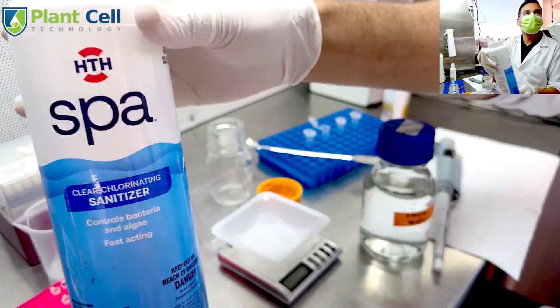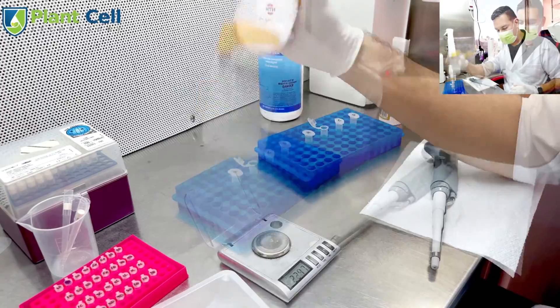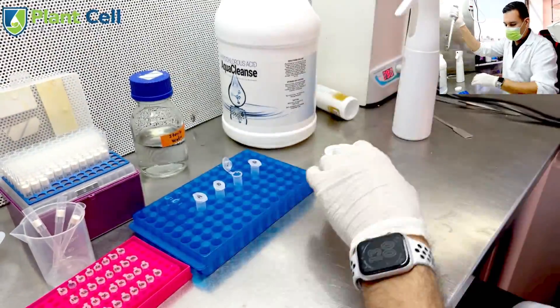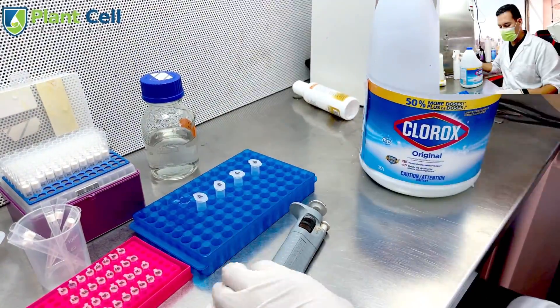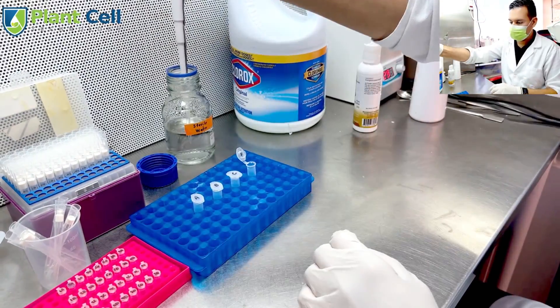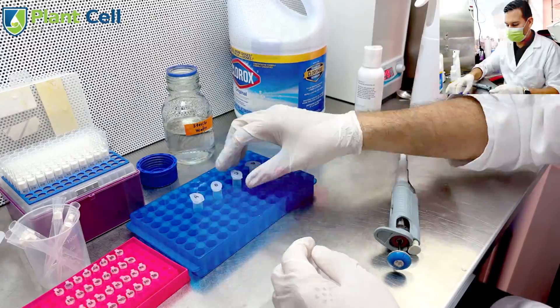My second sterilizing agent is sodium dichloro. To make it, I take 100 milliliters of water, measure 0.1 grams of sodium dichloro, agitate until dissolved, and then take the 2 milliliters I need to sterilize the seeds. Third, I'm using hypochlorous acid for the first time — one part hypochlorous acid to three parts water. Lastly is the classic 10% bleach solution: one part bleach and nine parts water. I add the surfactant to every single one of these solutions.